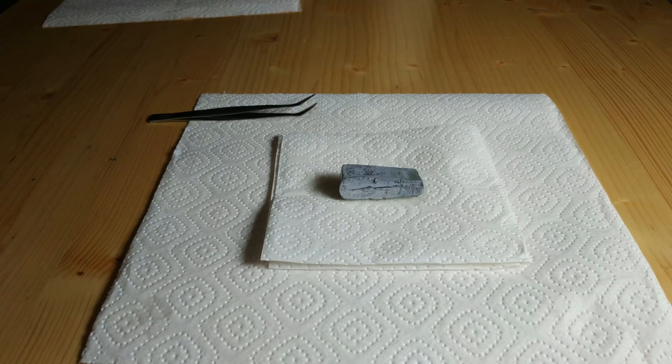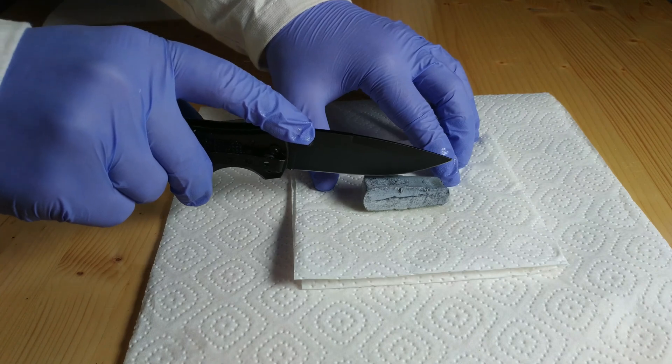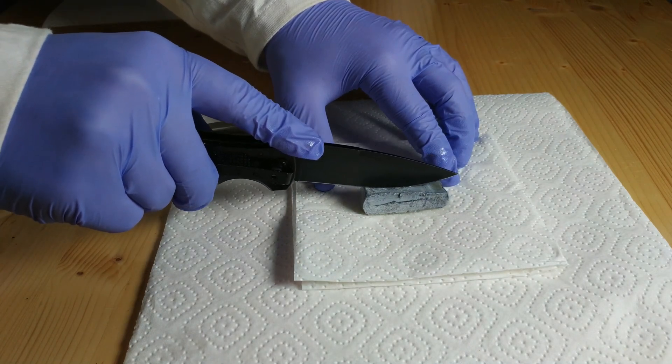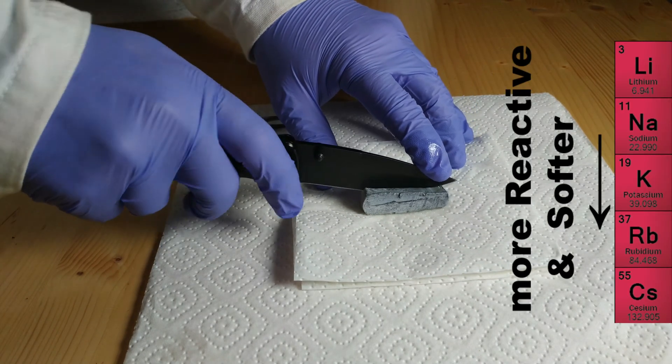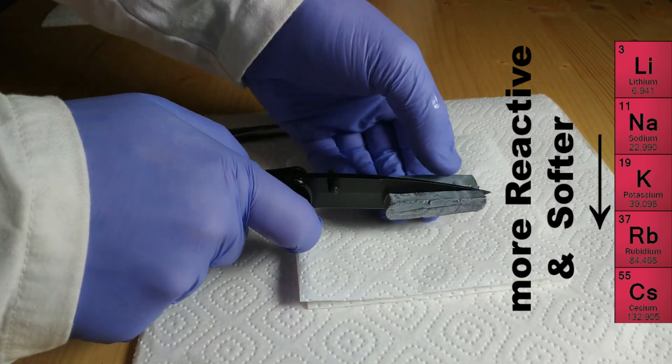Greetings! In this video I will cut potassium and present the fresh metallic surface. The further down you go on the periodic table, the more reactive and softer the alkali metals are.